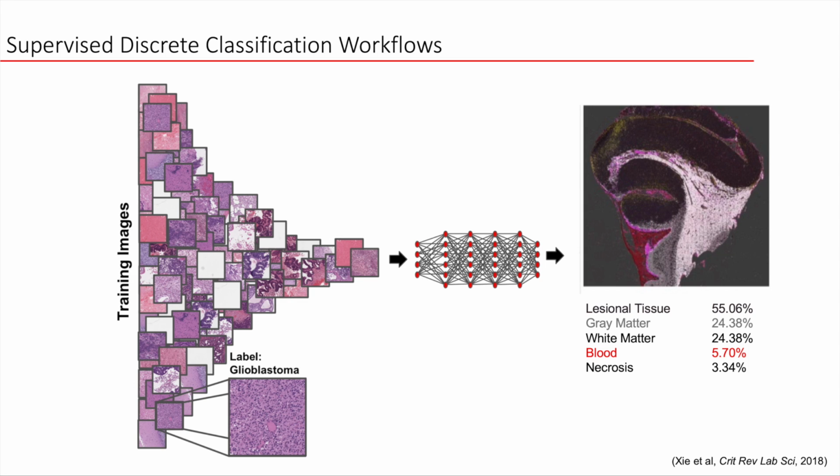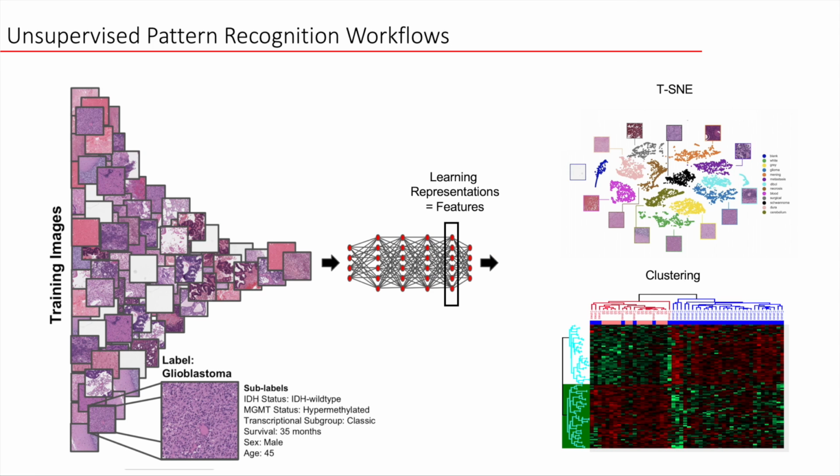So let's look at some of those based on some of the work that we're doing. This is again an example of a supervised classification task. You train a neural network, then you pass an image through, and you get a very discrete outcome where it classifies it based on what you've taught it. In unsupervised learning, instead of letting the image go all the way through, we're more interested in how this image registered at these different nodes within the neural network.